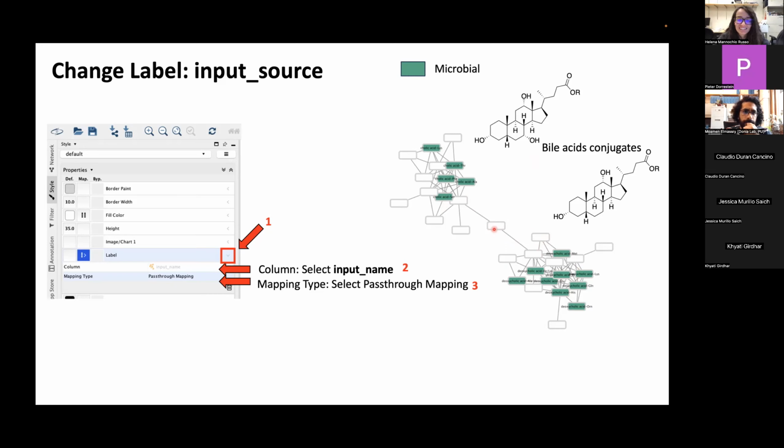Yeah, I think I can give a slightly clearer explanation. Originally, some of these new microbial metabolites, such as these bile acids, where you see the R is modified differently. Typically, we knew about glycocholic acids, which has a glycine attached. But if you look at some of the deltas, so one of the edges, and let's say it's 90 point something, based on my experience in proteomics, I knew there was a glycine to phenylalanine substitution. So you can start to inspect the edges in relationship to something that's annotated and try to predict what kind of modification there is.